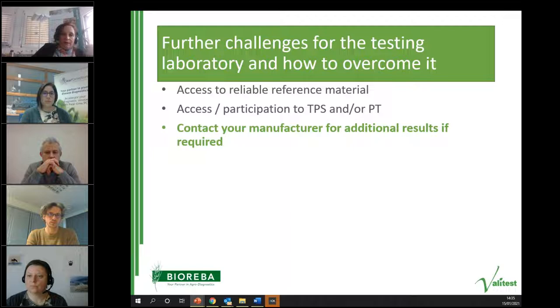Further challenges for testing laboratories are also to have access to reliable reference material and also the possibility to participate in TPS, test performance studies, and proficiency testing, sorry. And we state some information on our product information, but there's always additional data available. So don't hesitate to contact us for additional results if there is a need. Thank you very much. Then I will give the word to Marta.